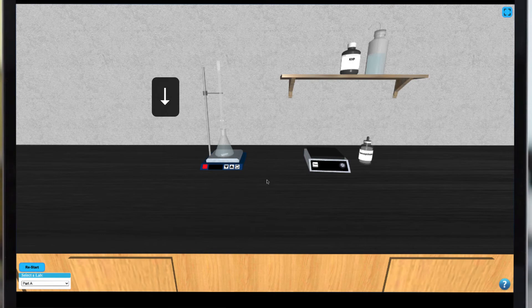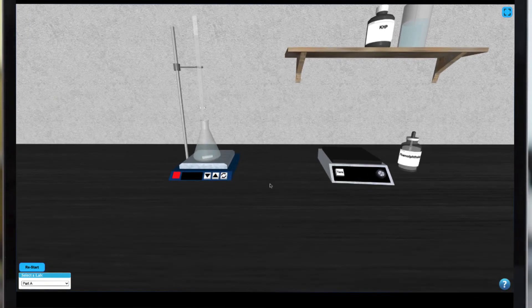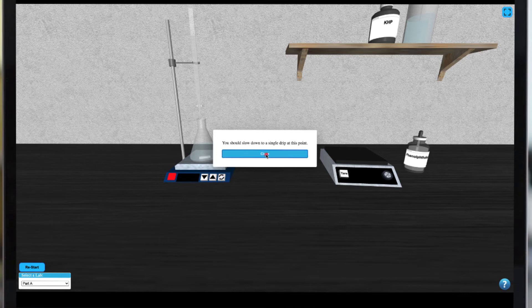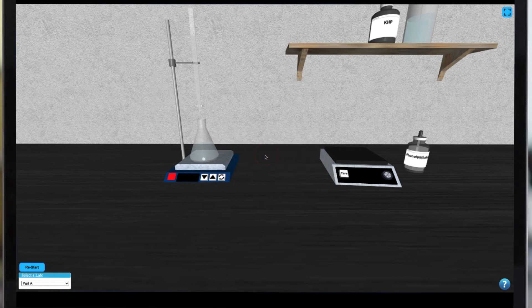Stemple will warn you when you're about to reach the endpoint of the titration. At this point, simply continue to add from the burette dropwise by tapping the down arrow key and watching your sample for a color change.